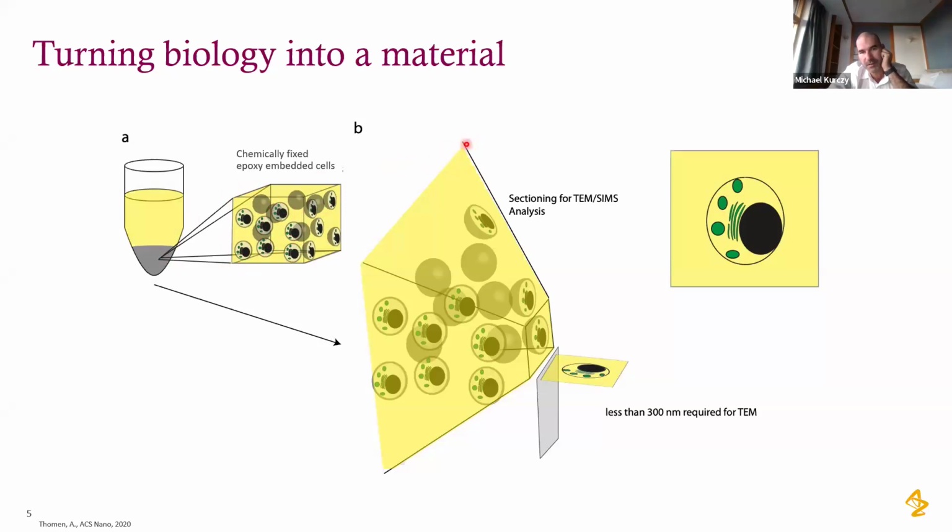bullet gets shaved down so that you can cut very tiny sections. I mean, you don't get a section with one cell, of course, but that's just artistic license. And then we can take that section to the TEM, and that's sort of what it looks like.